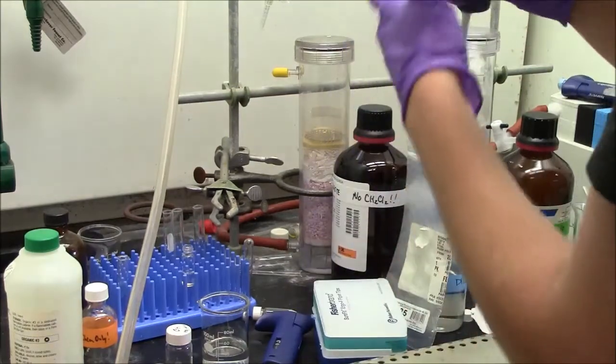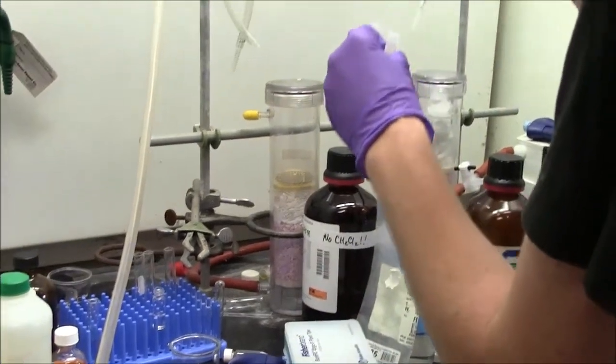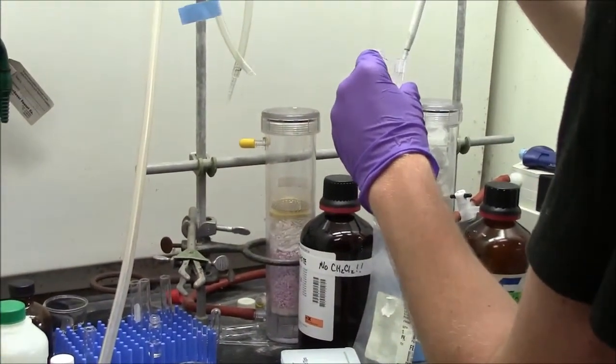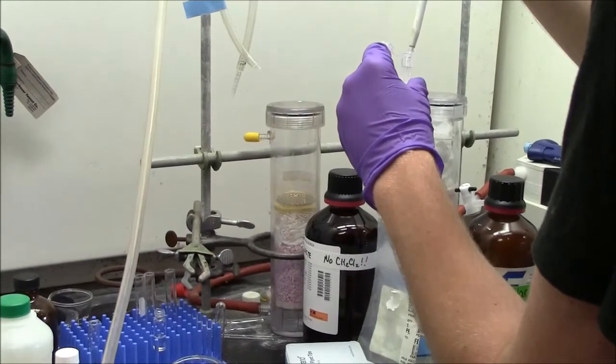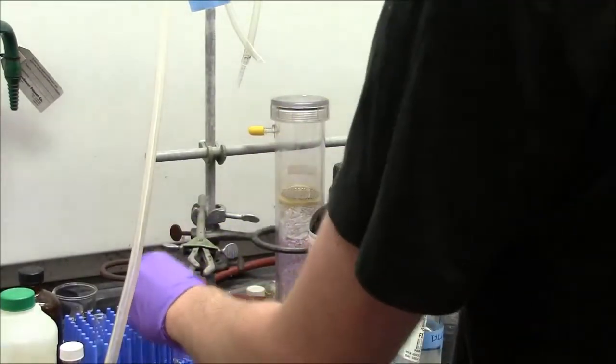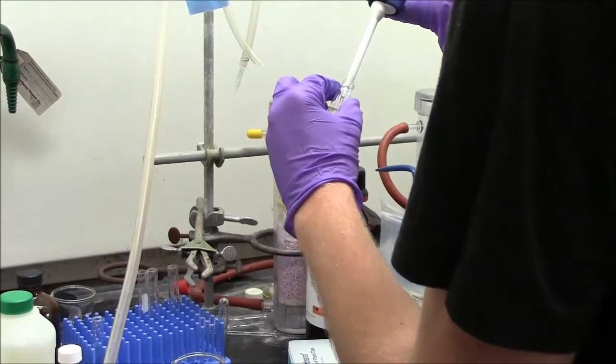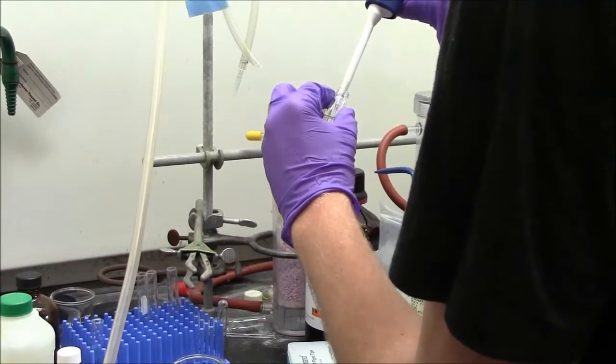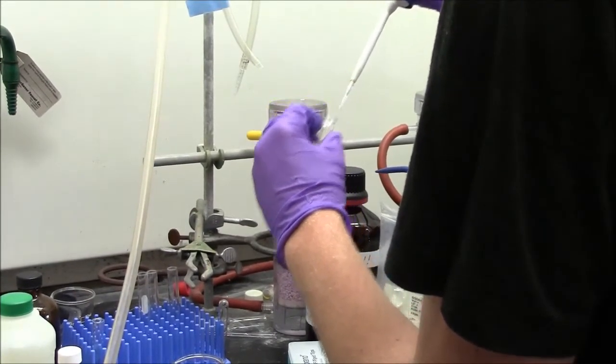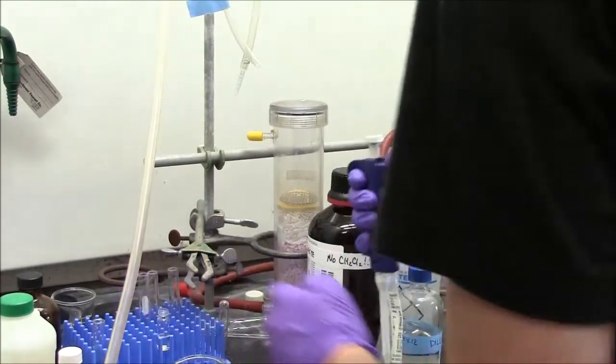Here Nick Markman is adding APS, ammonium persulfate, and SDS to the monomer mixture. He is adding the APS first, that is your free radical initiator, and he will add the SDS second. I am not sure whether the order of addition really matters much.